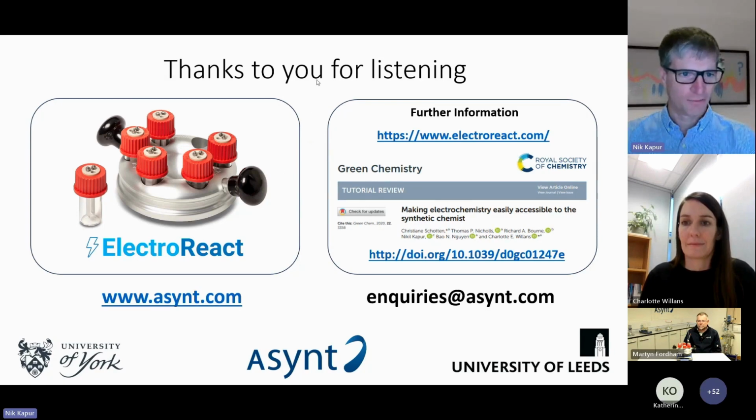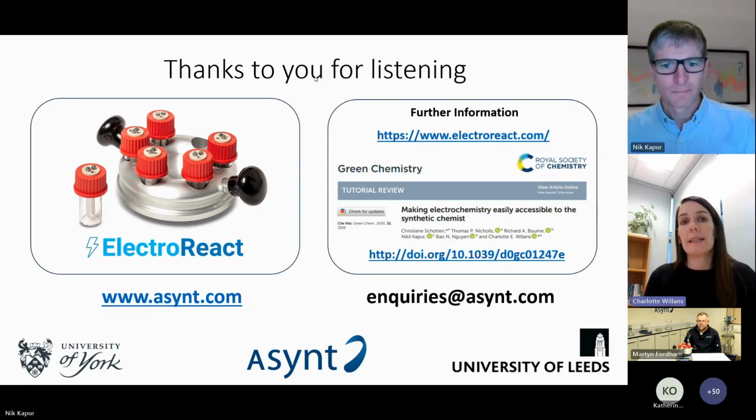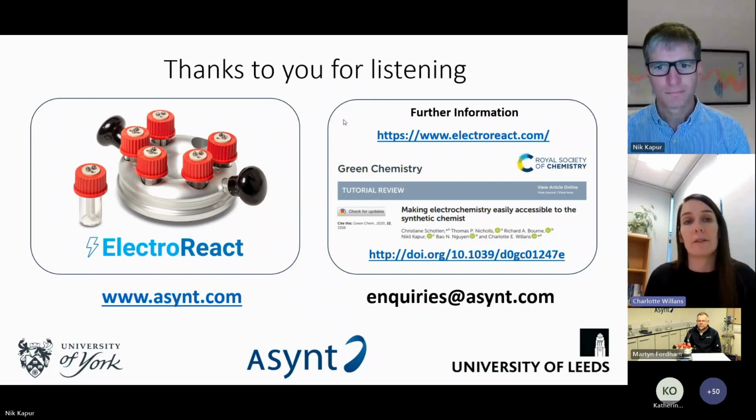And Charlotte, I guess there's probably typical voltages you would use in these reactions. Yeah, what I would say is the highest risk of doing electrosynthesis is if the electrodes were to touch each other. And then, of course, you're in a flammable solvent. But the really nice thing is that the electrodes are held very firmly, securely. They're at a fixed distance apart, so there's no risk of them touching each other. So that limits the risk there.